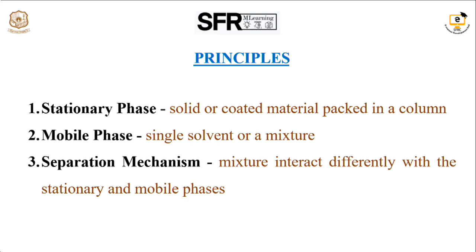Next is the separation mechanism. The components in the mixture interact differently with the stationary and mobile phases, leading to varying travel times. Travel time means retention time. The type of interaction depends on factors like polarity, size and ionic charges.